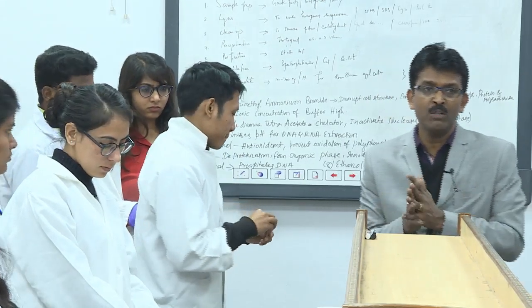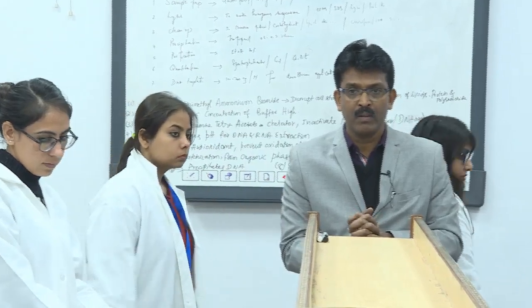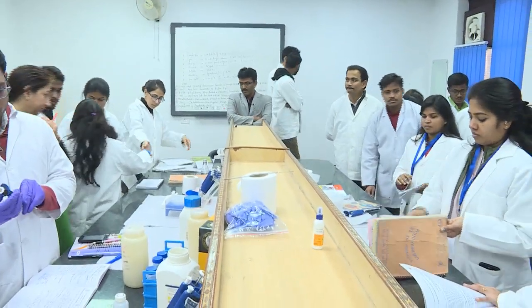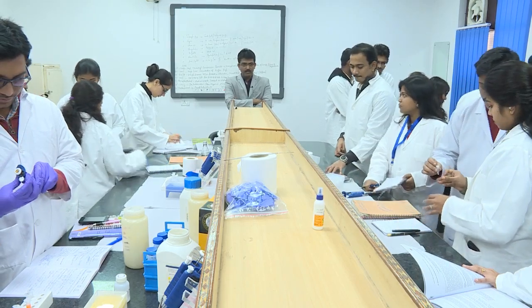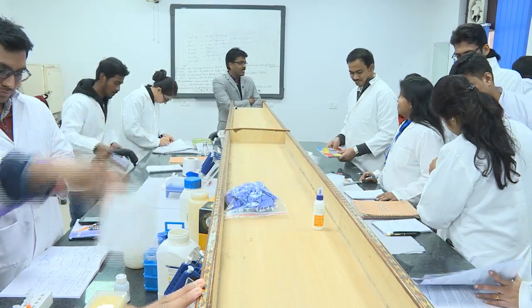Any doubts on the coding system we discussed now? So, I think the Kelex group is leading now, they are already with the DNA, and I quickly set up the PCR.